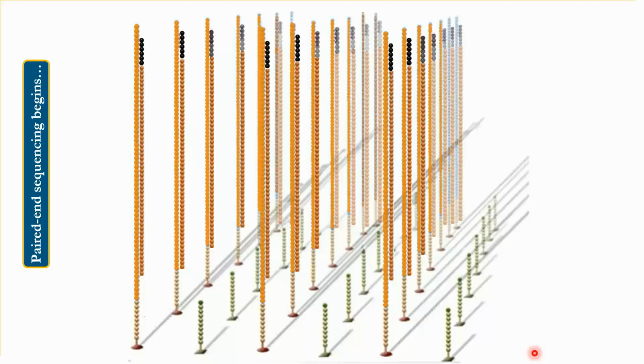Although sequencing from one end is complete, Illumina platforms often use paired end sequencing. This means DNA is sequenced from both ends of the fragment, so we obtain information from both ends of the DNA fragment. This is called paired end sequencing. This allows sequencing of the same DNA fragment from the opposite direction, generating read 2. This improves accuracy, alignment, and detection of structural variations.